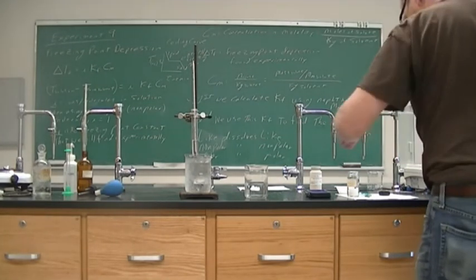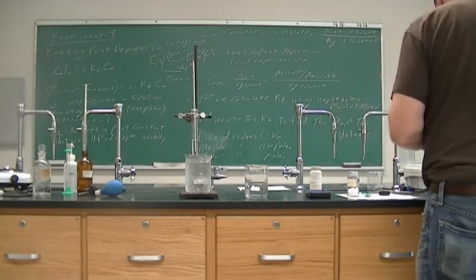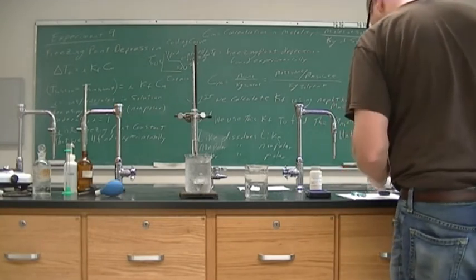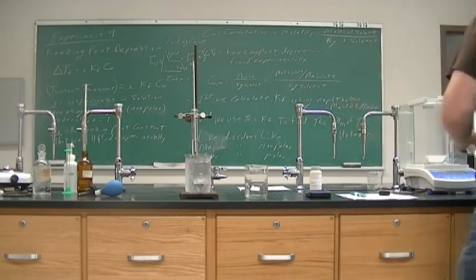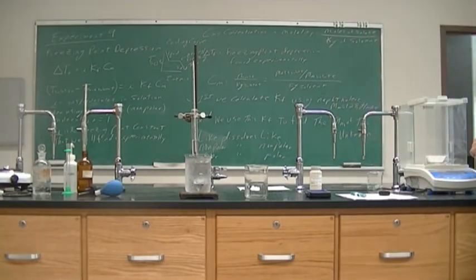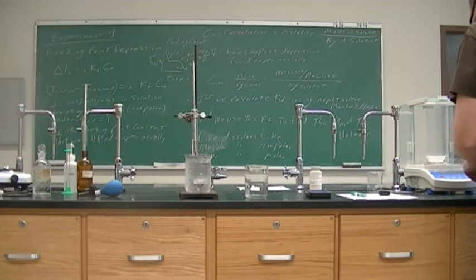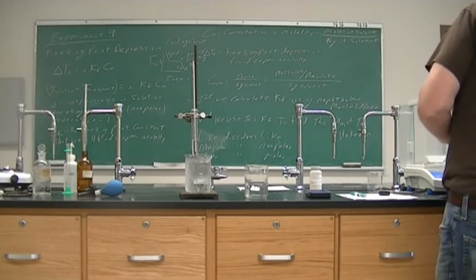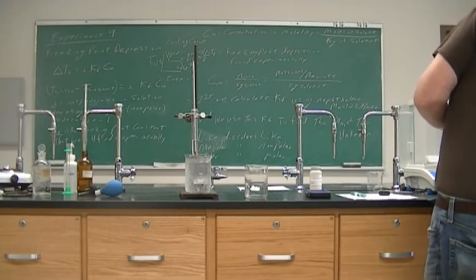All right, so we're going to weigh out 0.11 to 0.13 grams. So let's see what one chunk of this weighs. So these are pretty large chunks. Yep, that was too large. Let's find a smaller chunk.